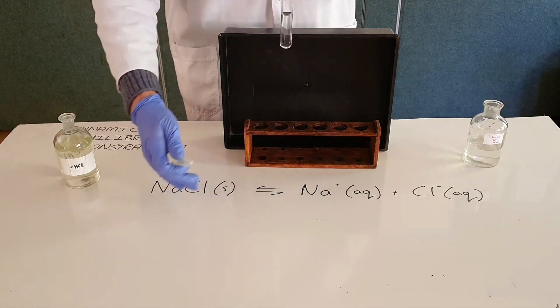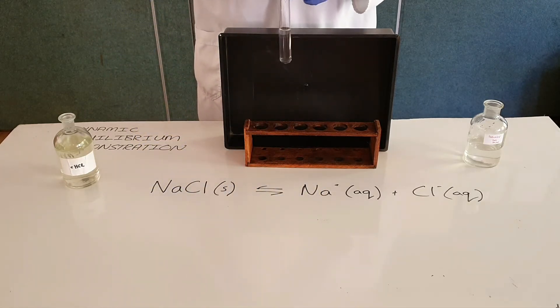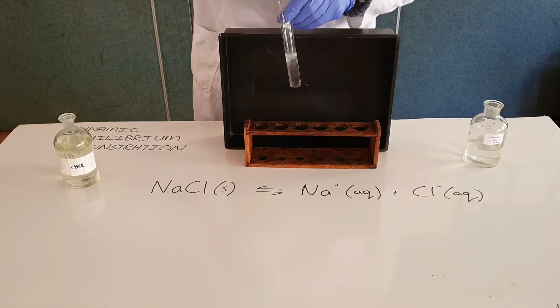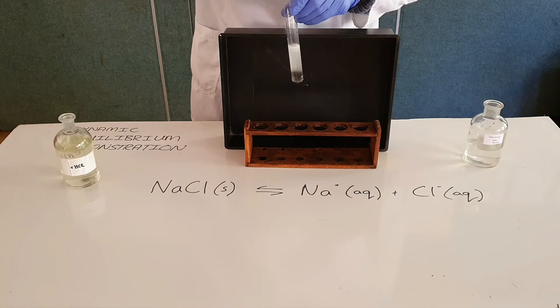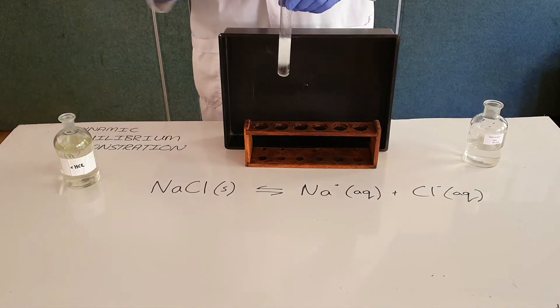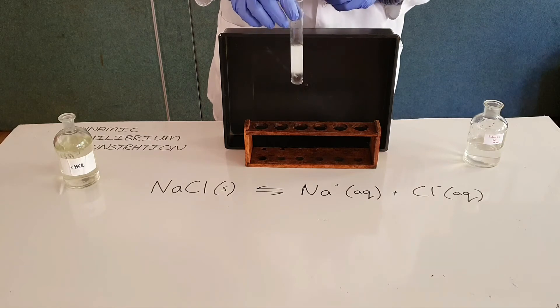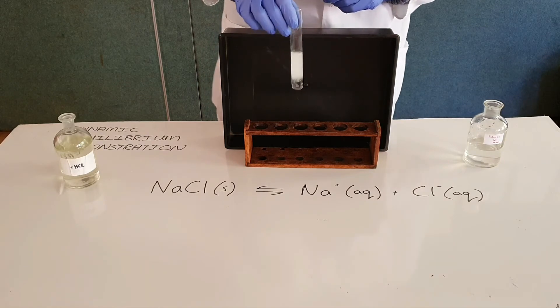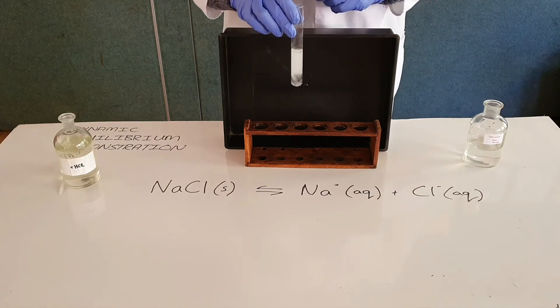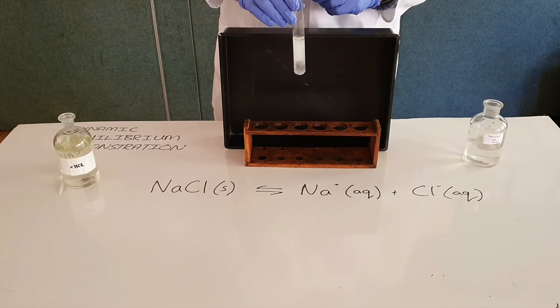We would expect to favor the reverse process, which produces more sodium chloride. We can see that in the form of a white precipitate — the solution goes cloudy, and that precipitate drops out and falls to the bottom of the test tube.